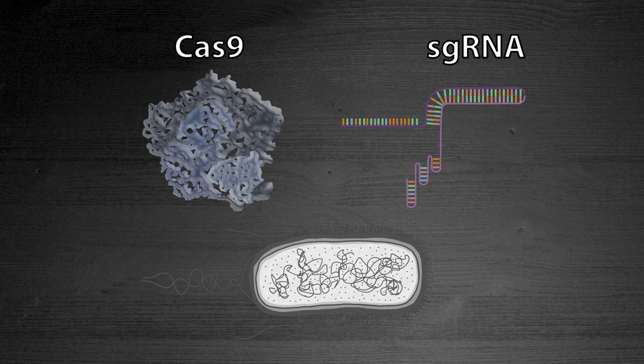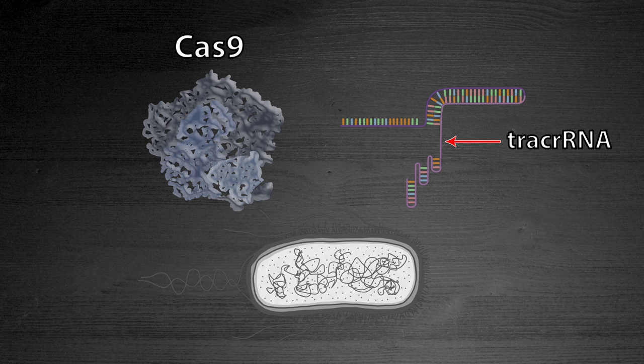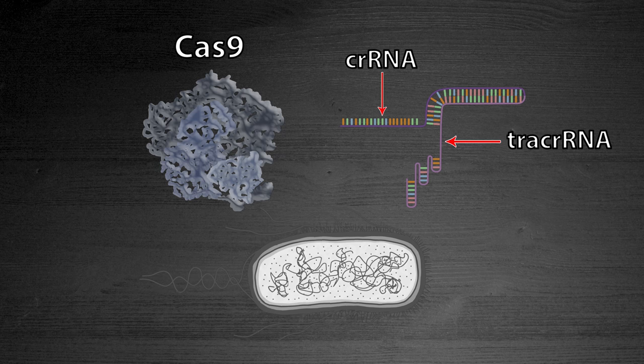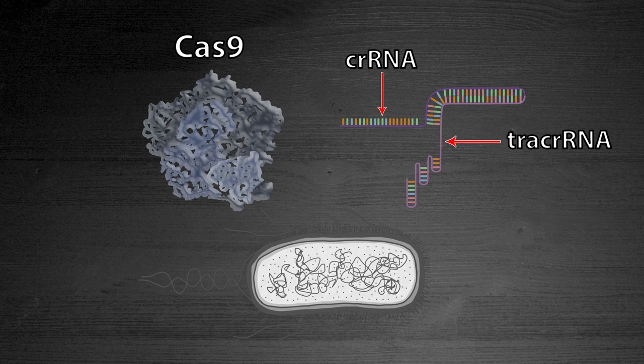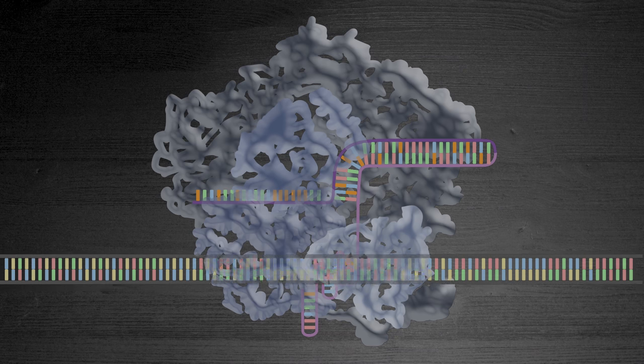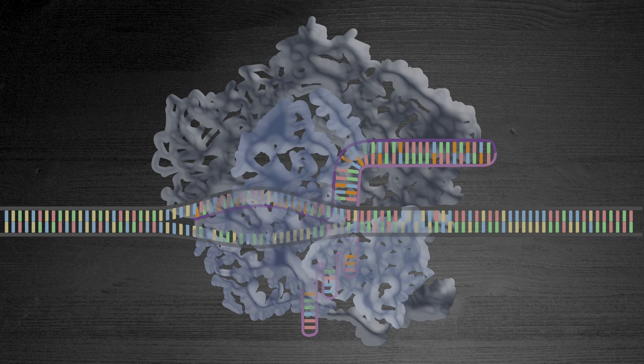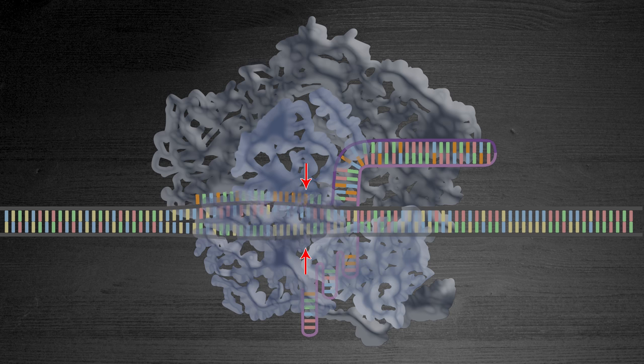The guide RNA itself is two components: trans-activating CRISPR RNA, or tracrRNA, and CRISPR RNA, or crRNA. Next, the guide RNA binds to the Cas9 protein. Together, it locates the specific area of interest on the E. coli's genome to which the CRISPR RNA binds, having the corresponding matching base pairs. The Cas9 then cuts both strands of the DNA.